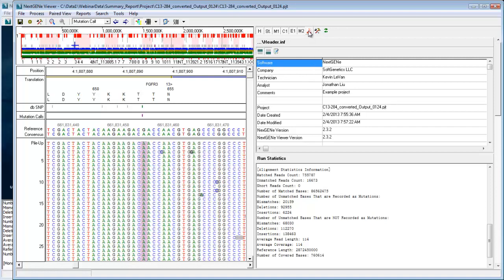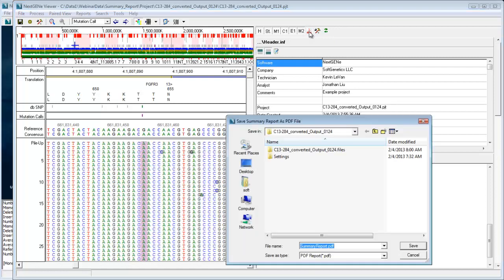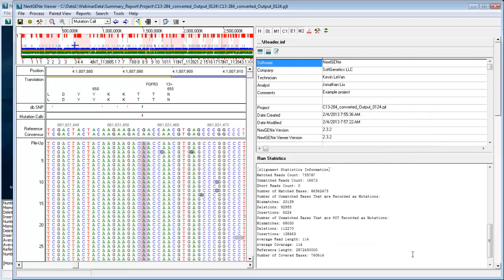And another nice feature about this is that you can save it as a PDF just by clicking on this PDF button here. So the summary report can be configured after you've already done an analysis through the viewer, like I've just shown here.